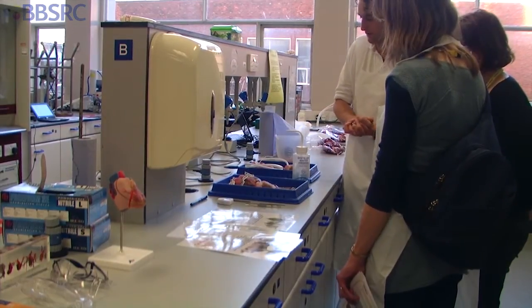Teachers seem really enthusiastic about looking at heart dissection in a different way — some who have done it a lot before, and some who haven't done it very much before. Hopefully people will be using it.